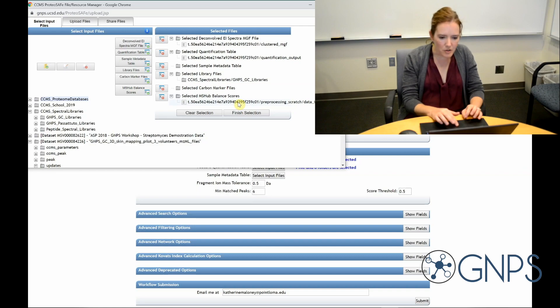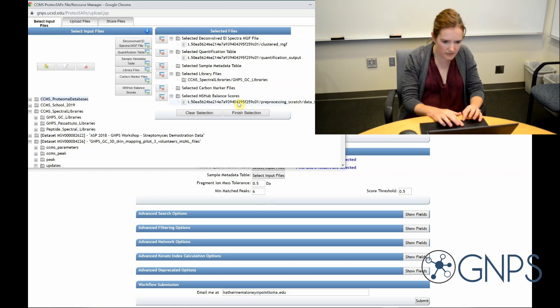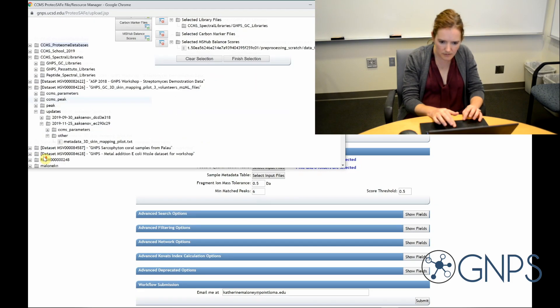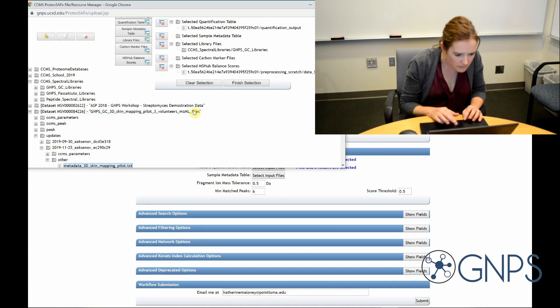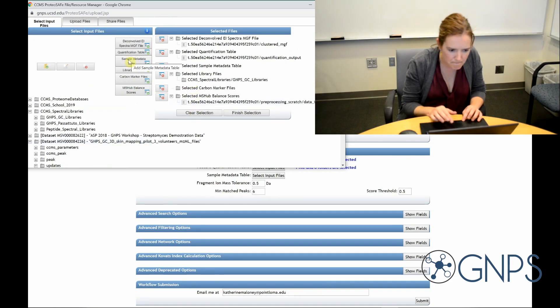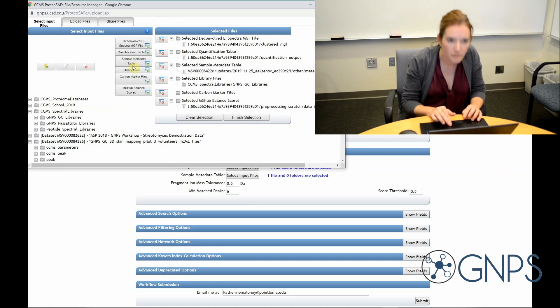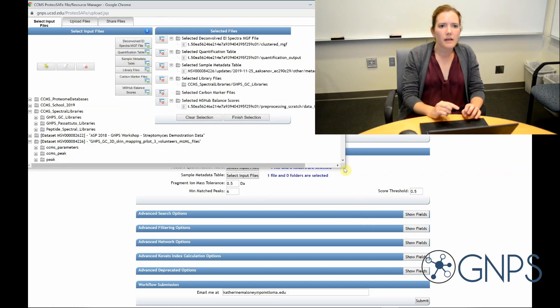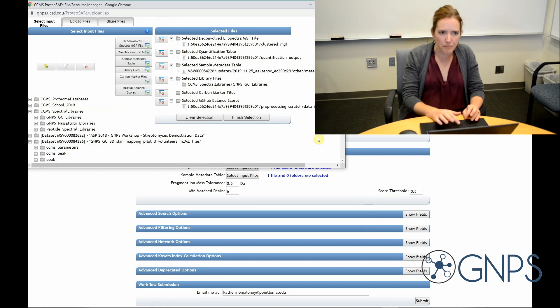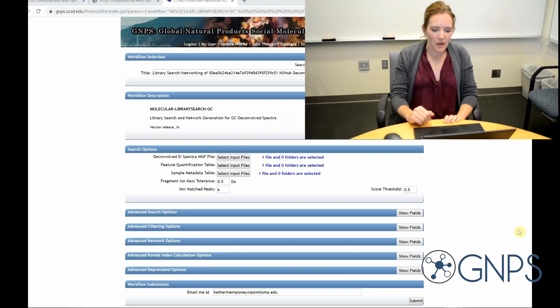I'm also going to add a metadata table for my data set. So let's find that. Here it is. But that's optional as well. So it will run either way. I can finish my selection.